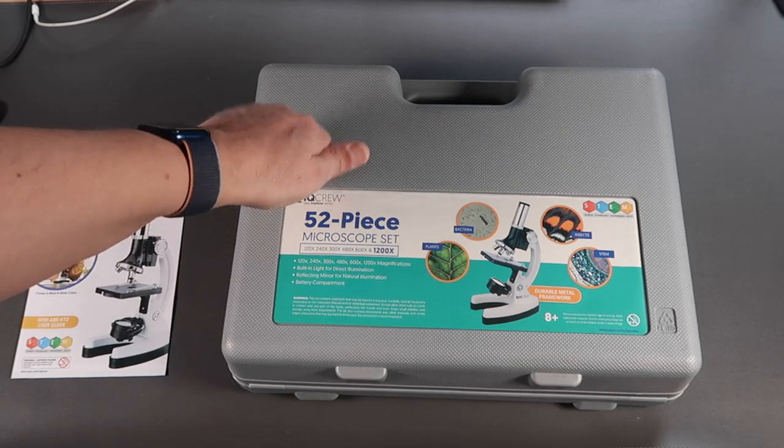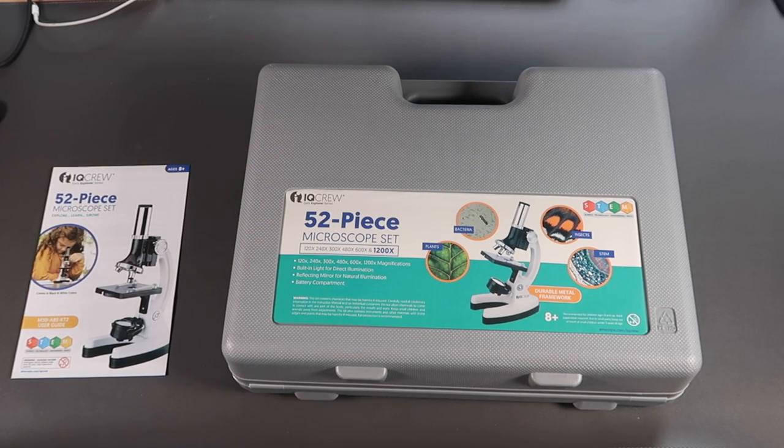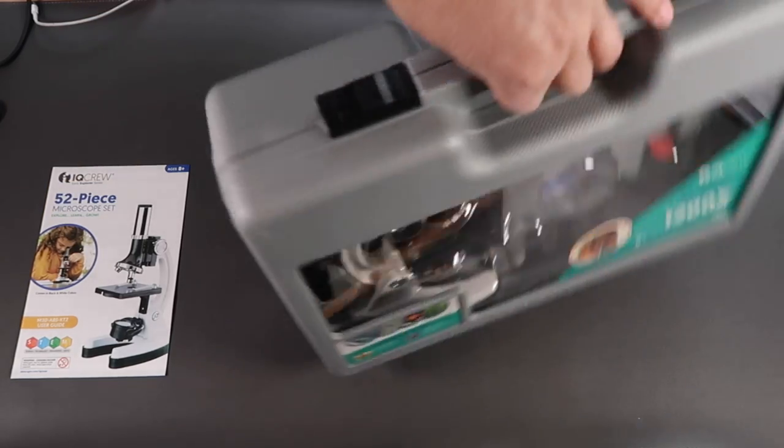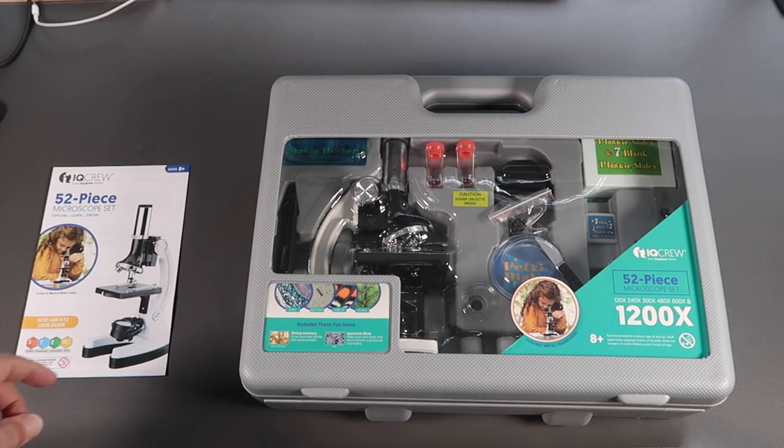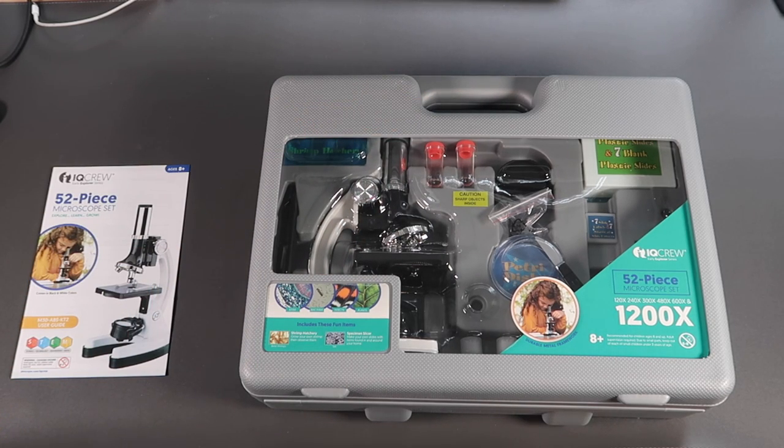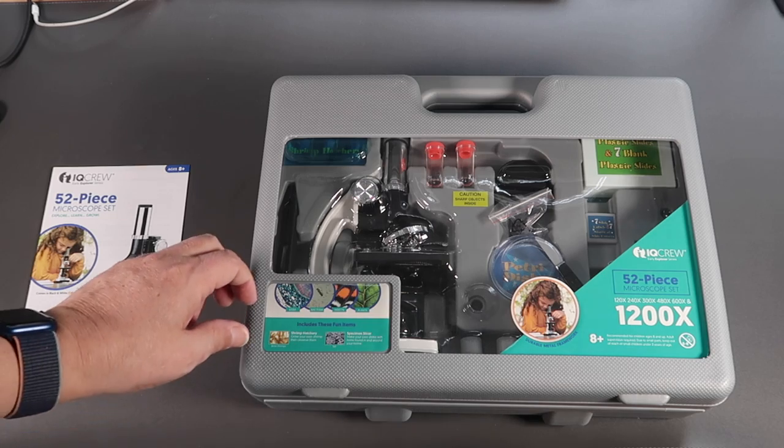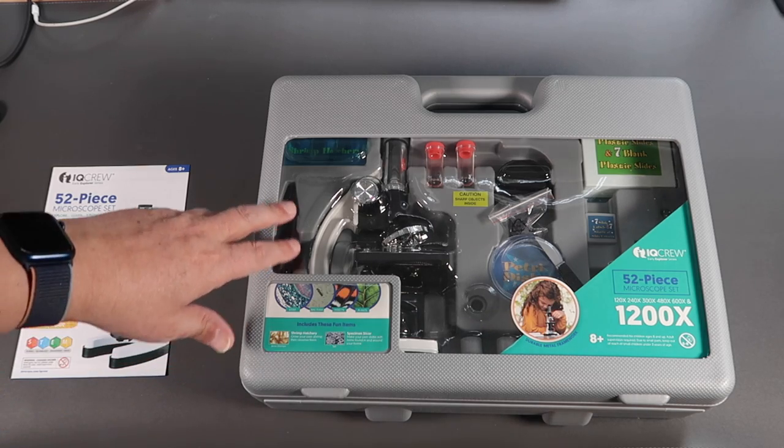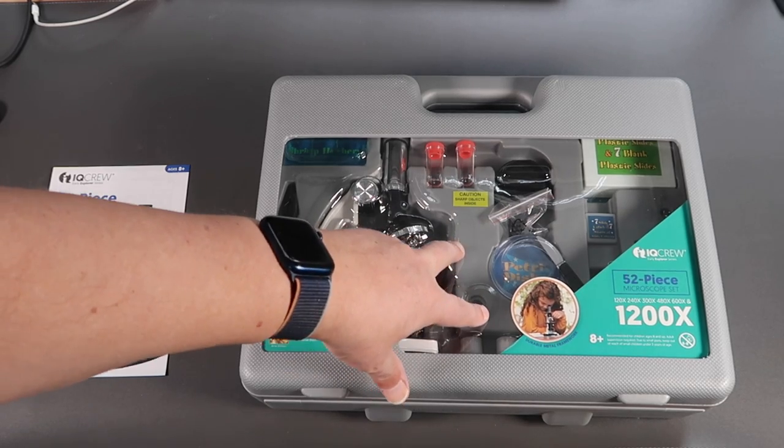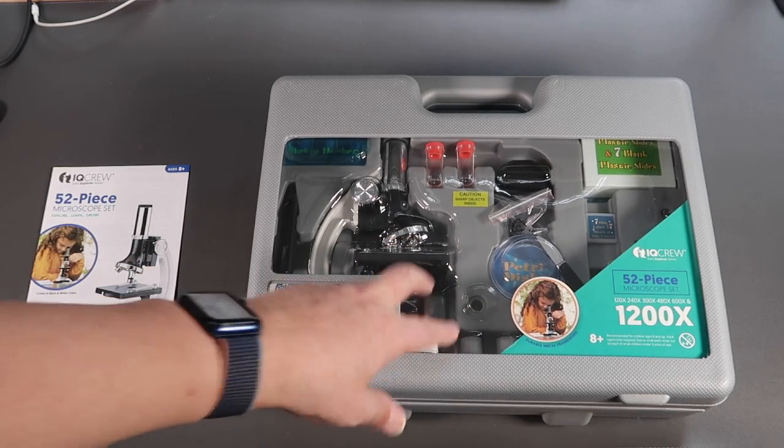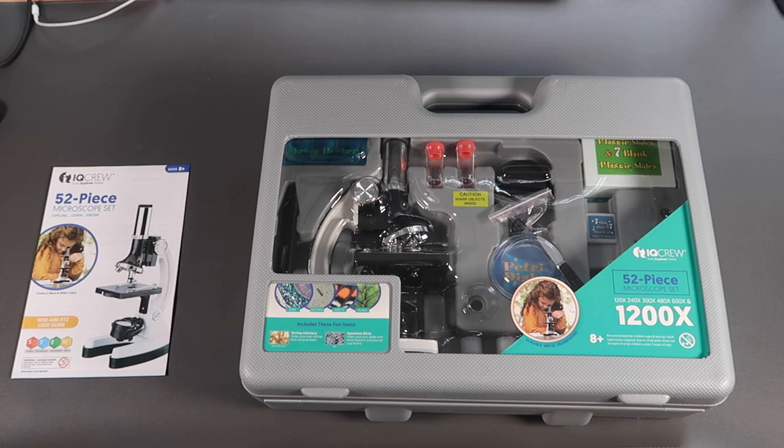It comes in this hard shell case, which on the face of it is a great carrying case. But on the other side they elected to do a display window of the components, which you can understand for marketing reasons, but it does prevent this making an actual practical case. You can carry it around like this, but it doesn't look quite as cool in my opinion.